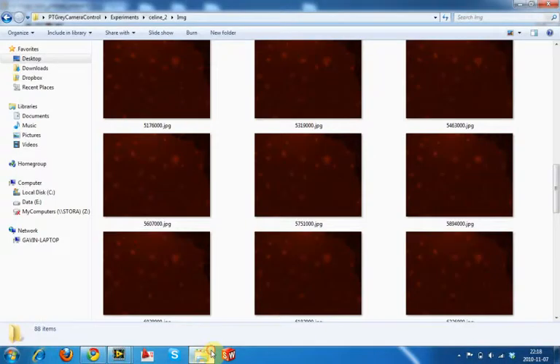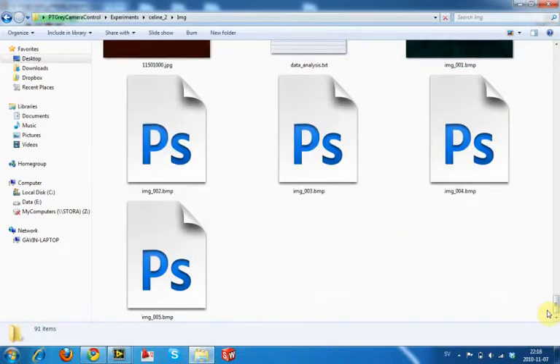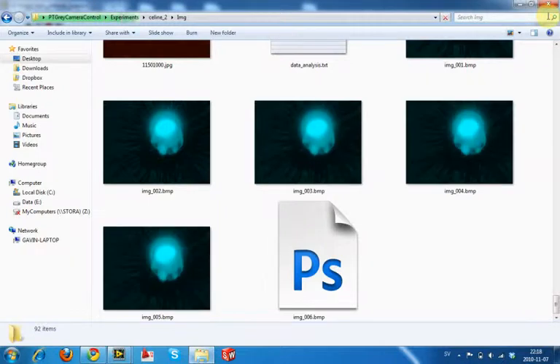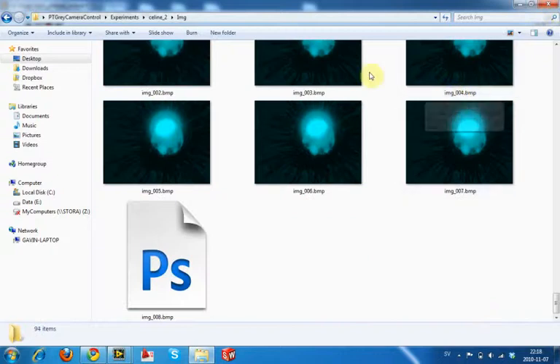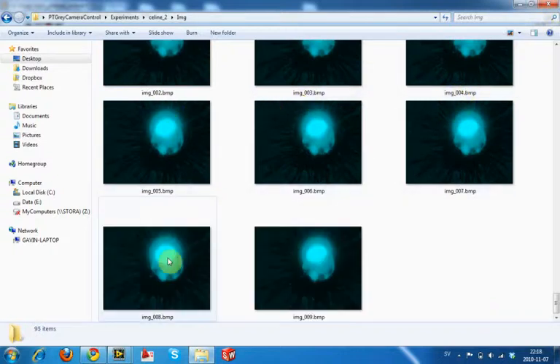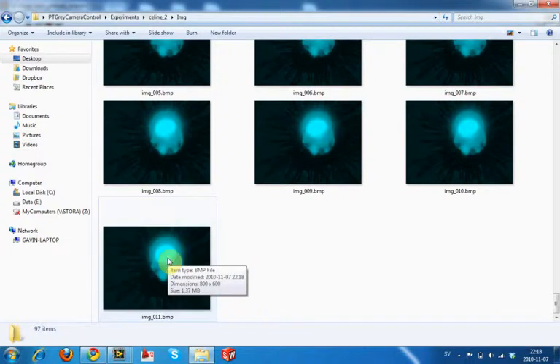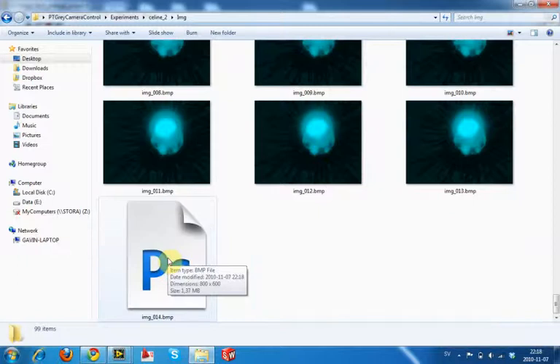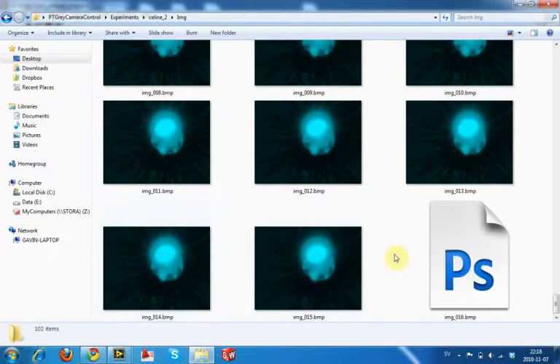And if we go to this folder, we should see these files start being made. So it's now remaking all the files. Pay attention to the file name. You know, this file name is now changed. It's been 0 padded so that the little sub-VI that I've written to actually 0 pad looks at how many files there are, so it knows how many zeros to put in place. And it's just going to chug along and make a whole nice set of new images in a different color, if that's something that you needed.